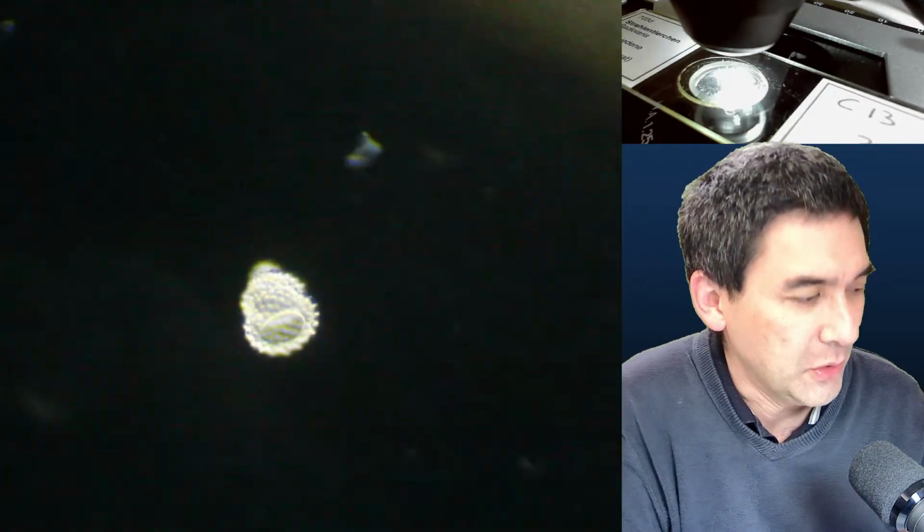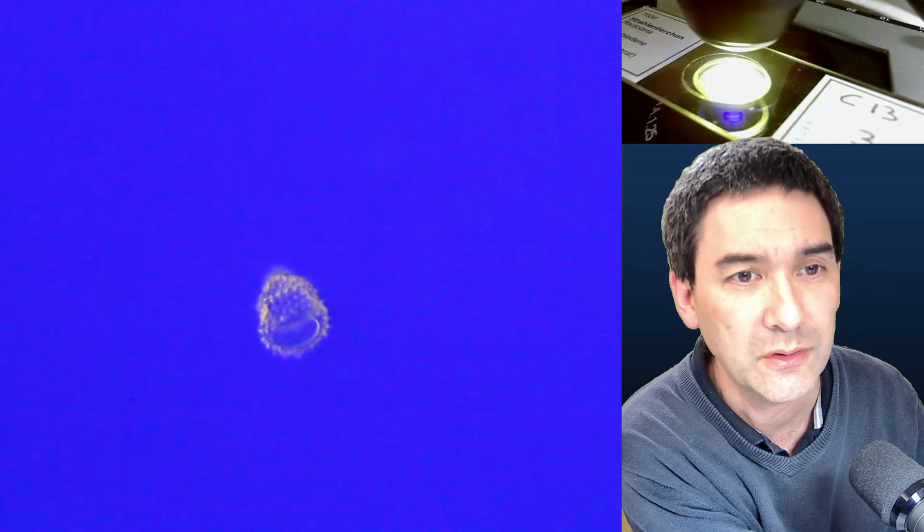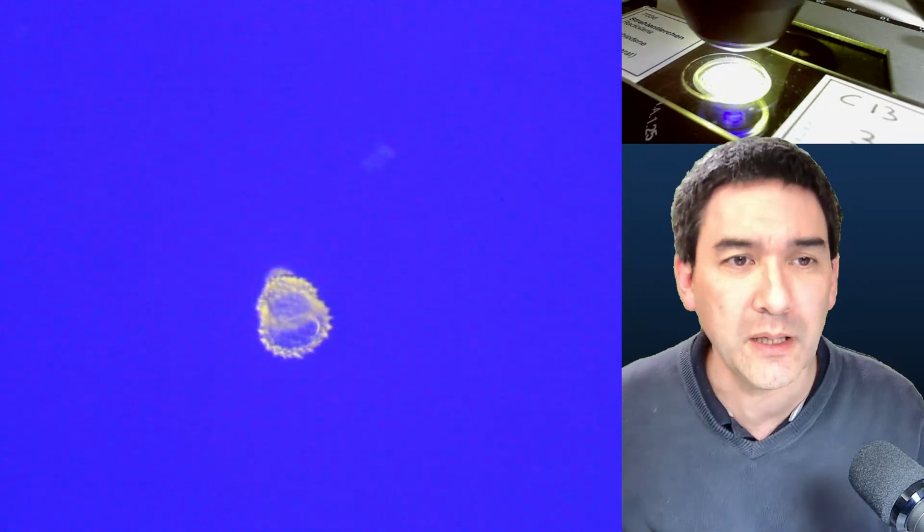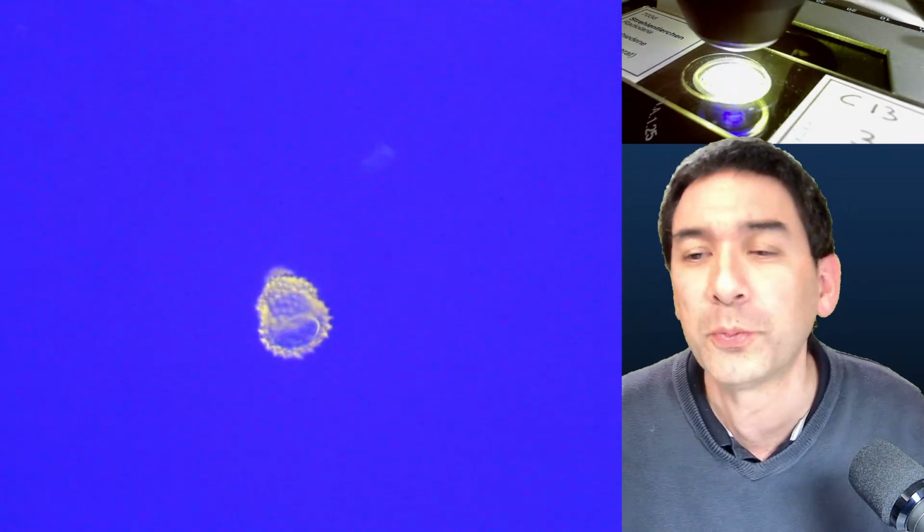And dark field is also very dust sensitive. As soon as you have a little bit of dust somewhere in the optical system, it's going to start to light up. The Rheinberg is not quite as dust sensitive, because the background is not completely dark. So this is called optical staining.